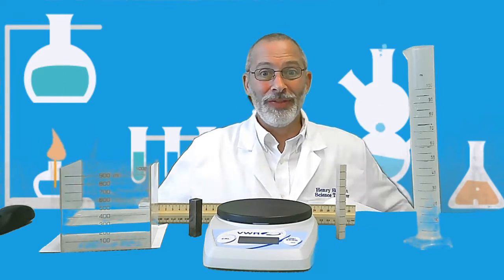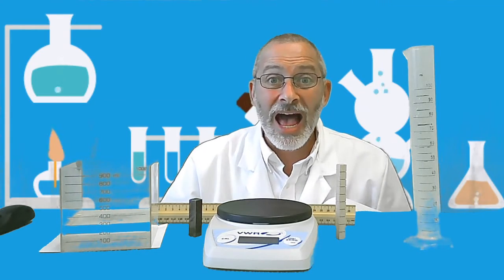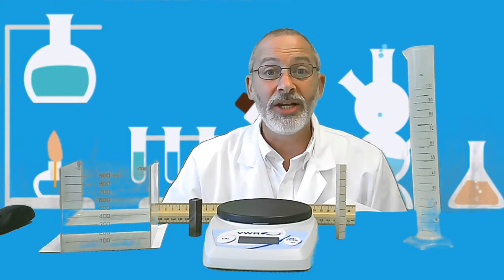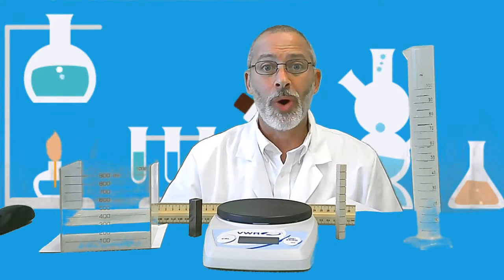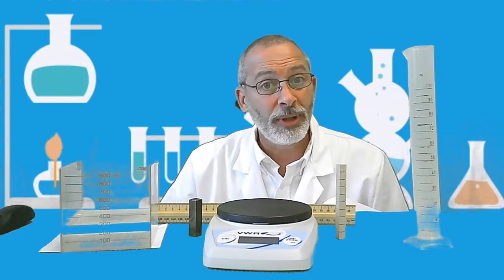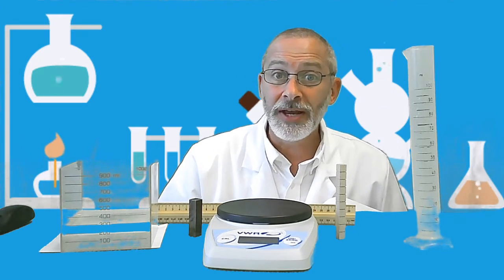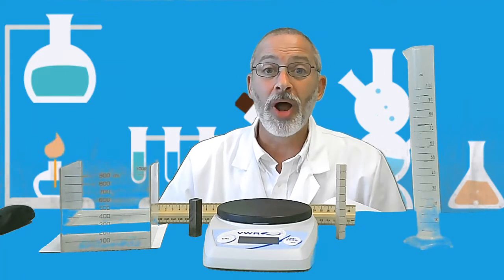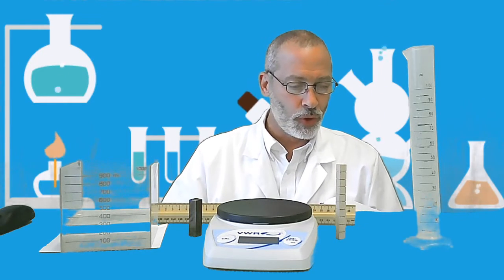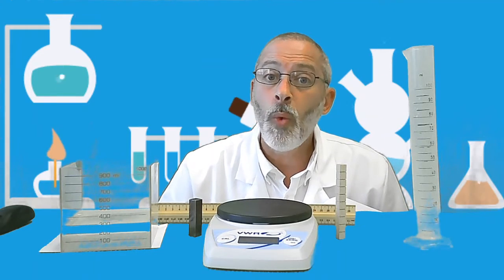Here we are in the close-up view of the laboratory to complete our lab activity now on page 28. So I will be collecting the data for you, and you are to complete the activity in your books. So let's get started. At the top of the page, the problem states, how can density be used to determine if an object will float in water?